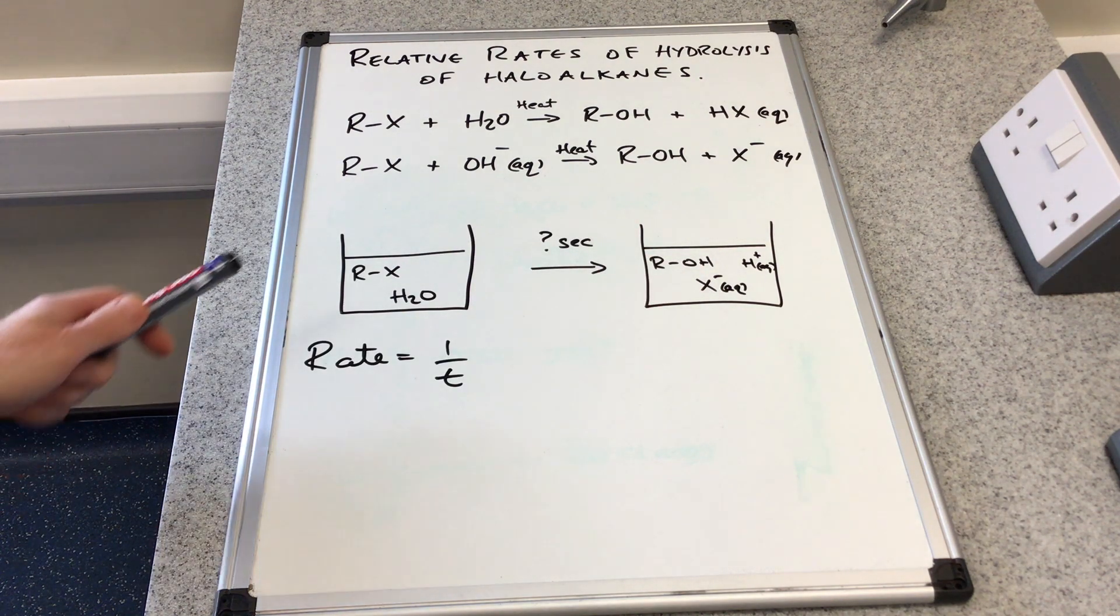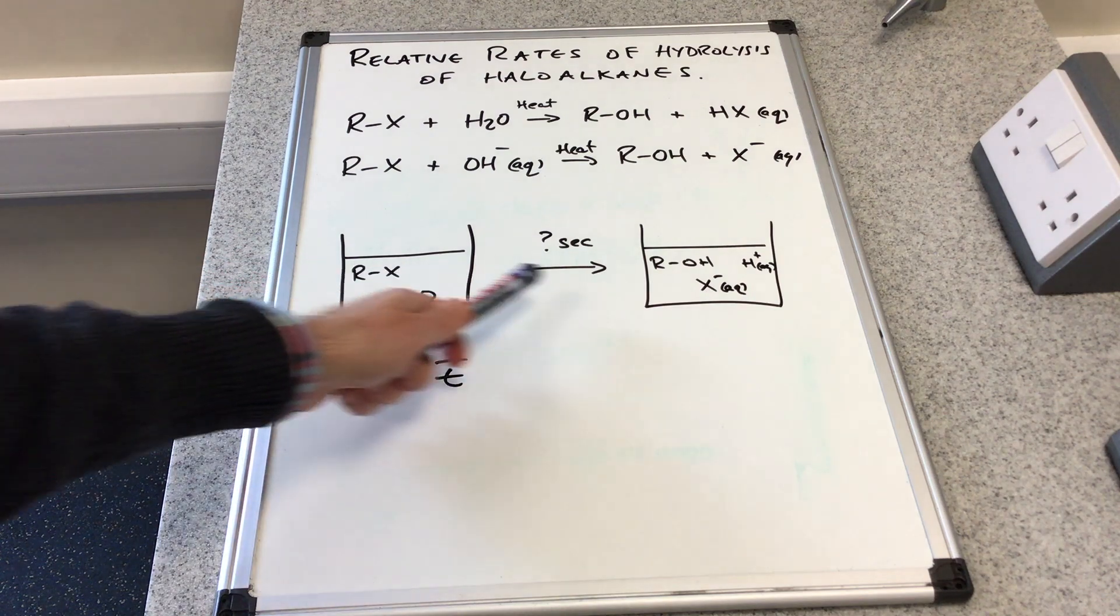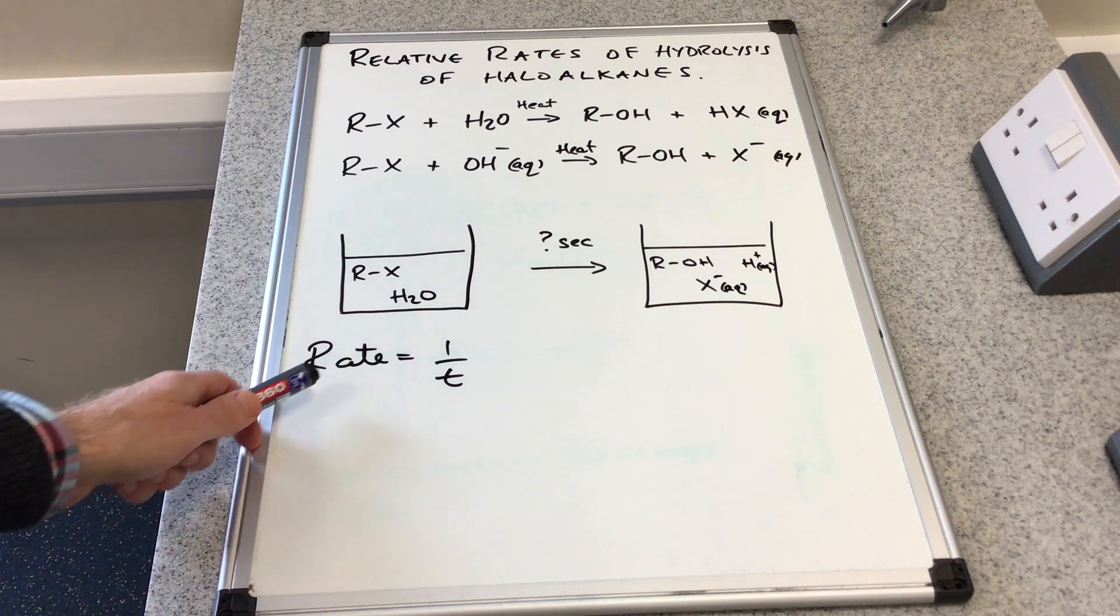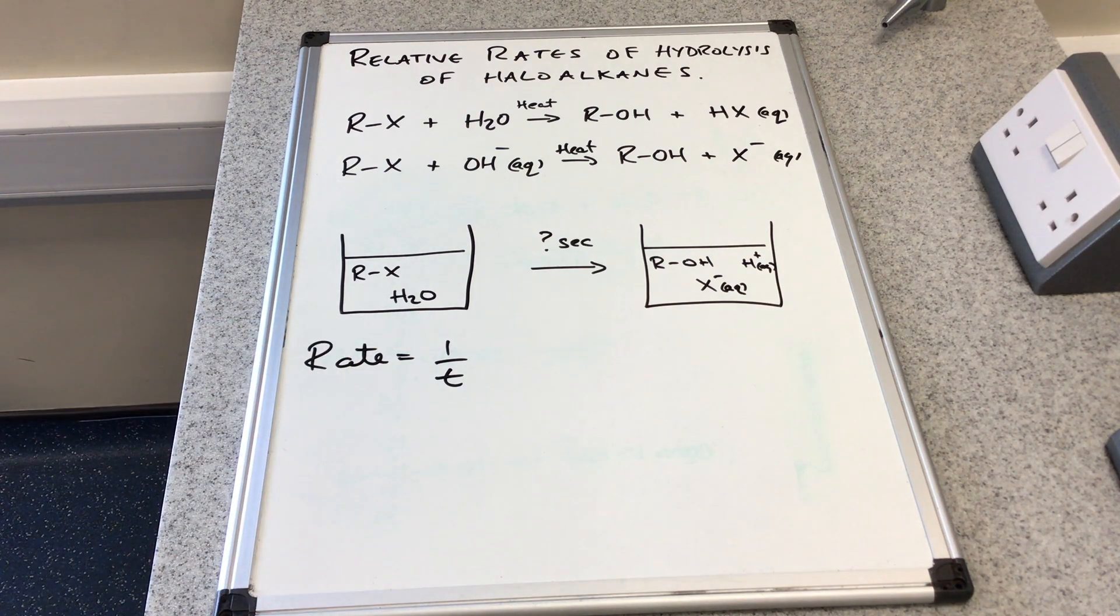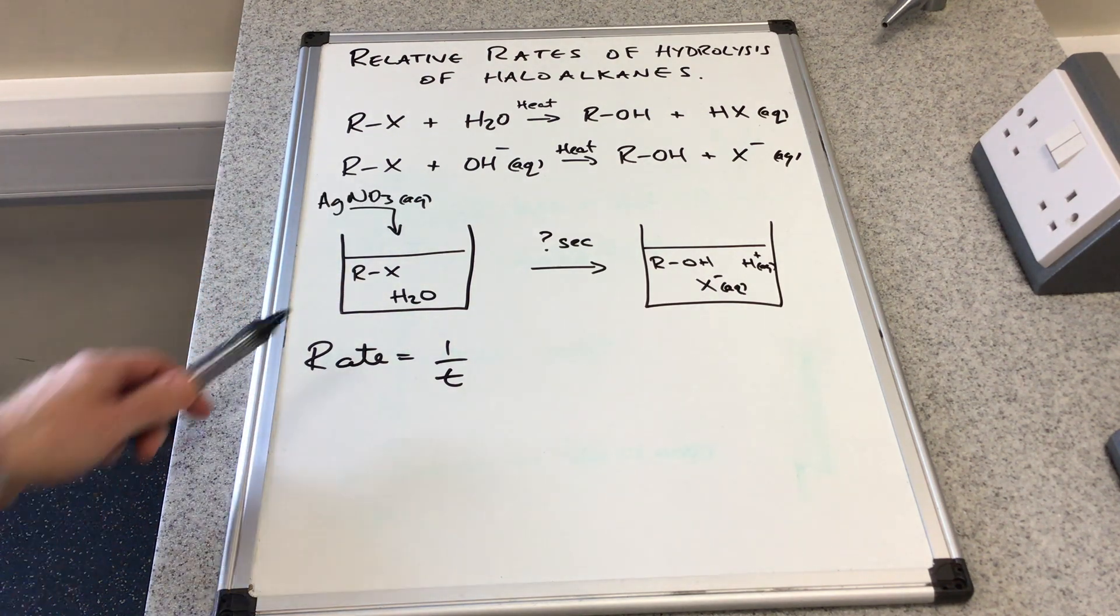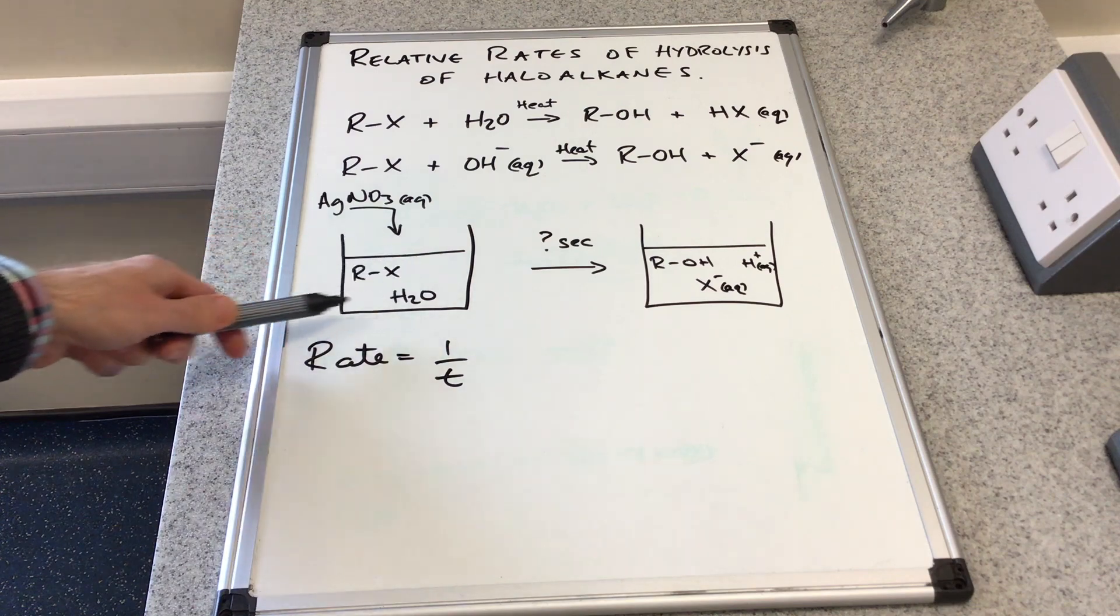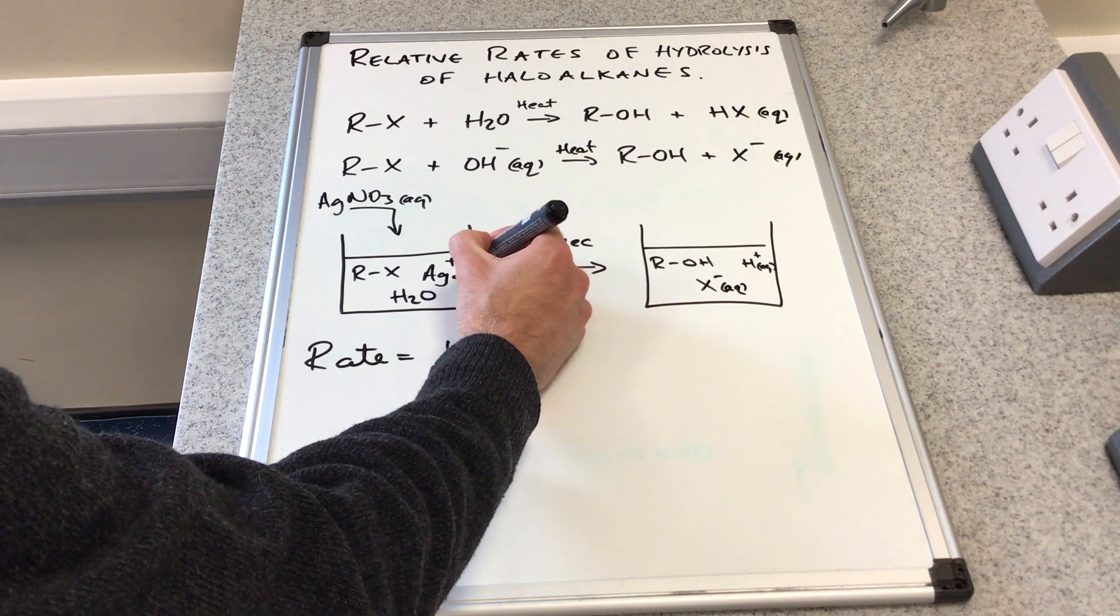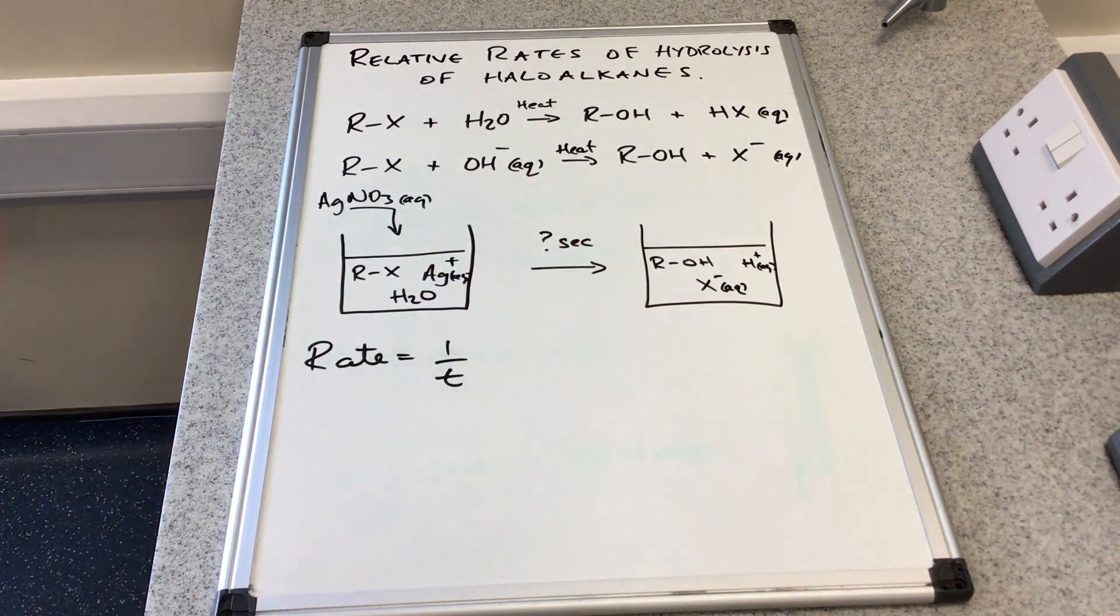We need a way of working out how long this reaction takes, and then to turn that into a rate we just do one divided by that time. The way we do that is we add some aqueous silver nitrate solution to the beaker at the start, introducing silver ions.